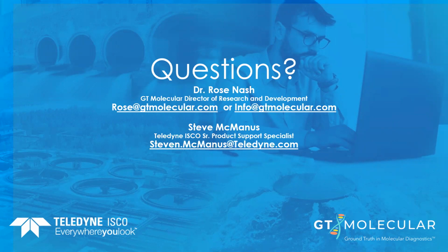Yes, absolutely. So the field has been doing a lot of experiments, we have as well, to try to understand how stable this RNA signal is in wastewater. The number one recommendation that's come out of this kind of work is to avoid freeze thawing. So a lot of people think, if I want to keep this for a while, I should put it in the freezer. However, the actual process of freezing the sample and then thawing it for analysis is highly detrimental to the RNA signal. There have been studies, and we've shown in our lab, that the RNA signal at 4 degrees, so in standard refrigeration, is stable for at least 2 weeks.